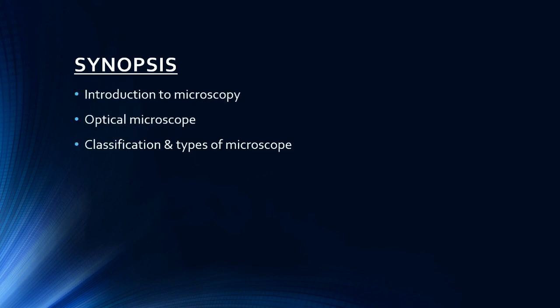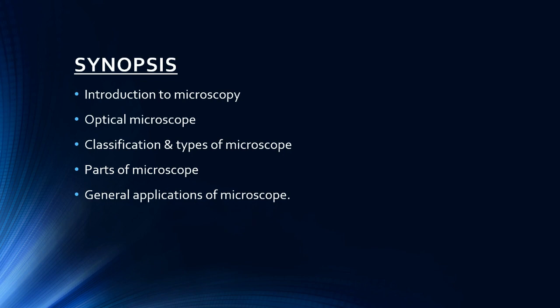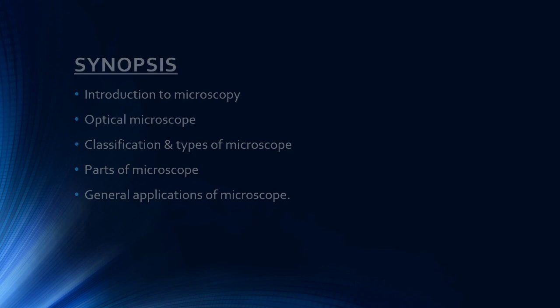In this video, we are going to learn about the introduction to microscopy, optical microscope, classification and types of microscope, parts of microscope and general applications of microscope.